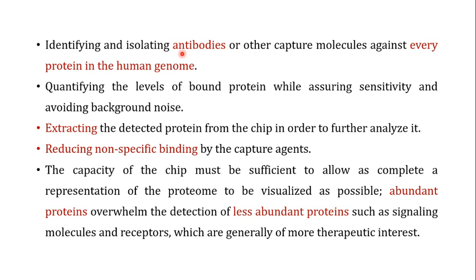Another important challenge is identifying and isolating antibodies or other capture molecules against every protein in the human genome, because currently you are not able to study the whole proteome of the human being utilizing the protein microarray, because of the unavailability of antibodies or capture molecules against every protein in the human genome.